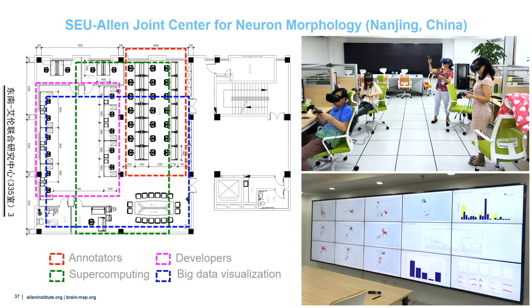After annotators are done with the annotation, all the morphology will be immediately shown on our large screen, also with the analysis result. In this way, you can really see the morphology, see the current status of our annotation and what the quality of the reconstruction we generated is.